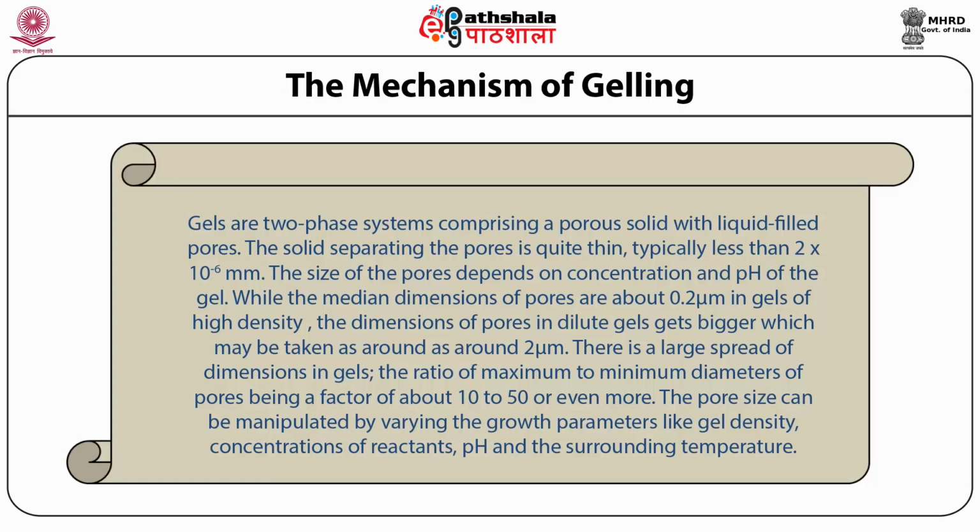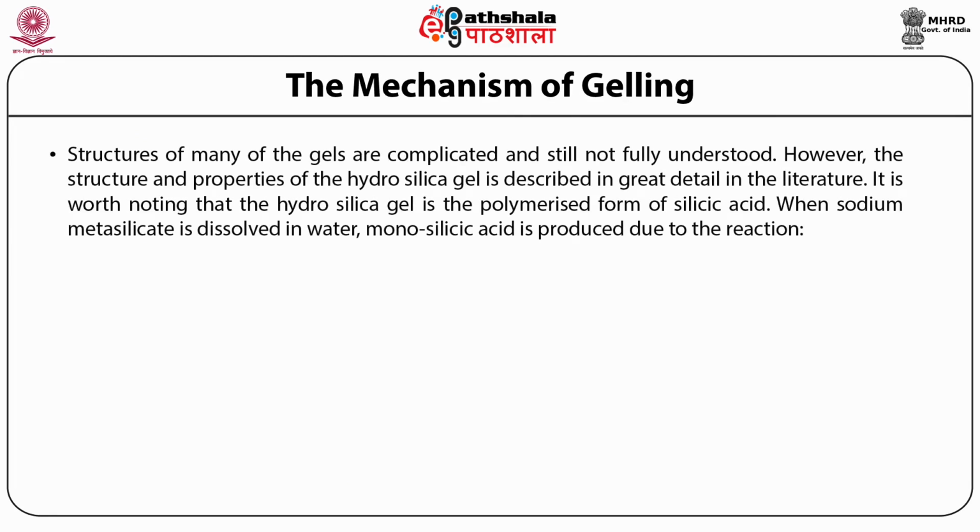The pore size can be manipulated by varying the growth parameters like gel density, concentrations of reactants, pH, and the surrounding temperature. Structures of many of the gels are complicated and still not fully understood. However, the structure and properties of the hydro-silica gel are described in great detail in the literature.